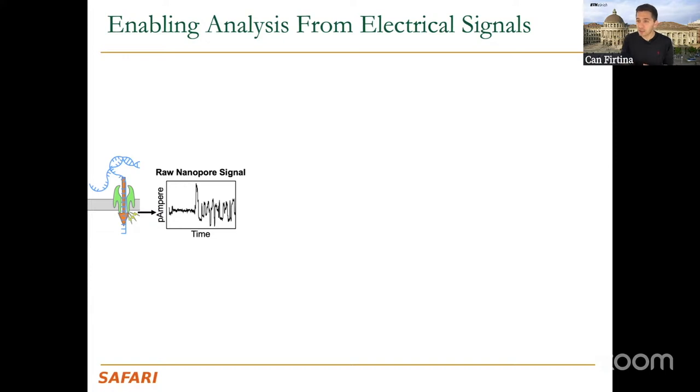So these are the important factors here. And of course, the speed that DNA moves through this pore also varies, which we refer to as translocation speed. But essentially, what will happen is that as we sequence, assume that we have an older version of nanopore, as we sequence the 6 nucleotide DNA portion, we will generate an electrical signal that is representative of these 6 nucleotides. But then the DNA will shift by one base, right?